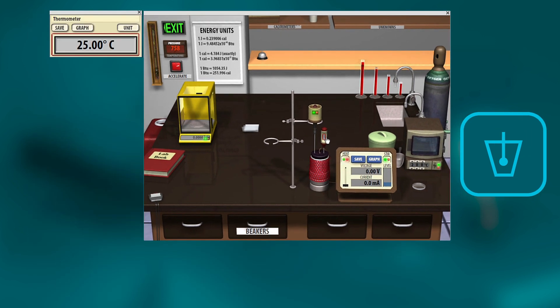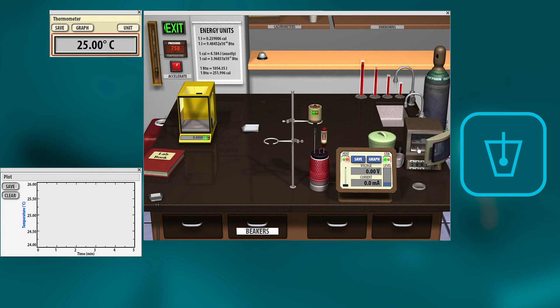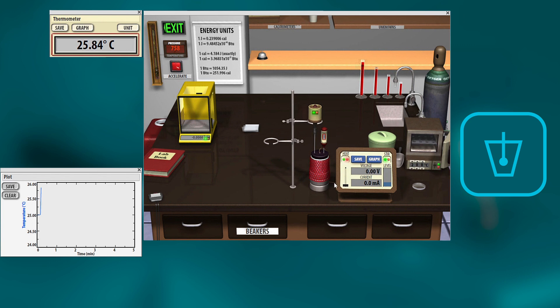We'll turn on the stir, turn on the thermometer. There you go. Now you can record the temperature of the water to start with. And now all we're going to do is add the mass of silver into the water and watch the temperature change. With that final change in temperature, you'll be able to find the specific heat of the metal.